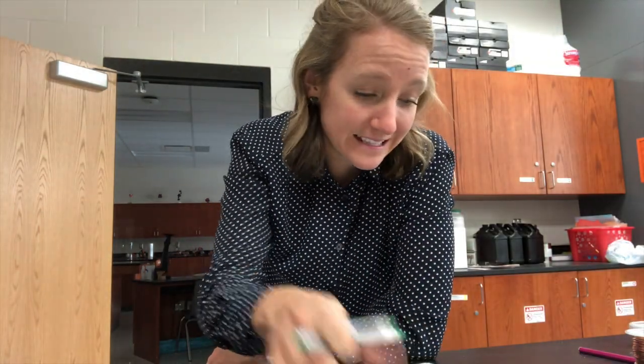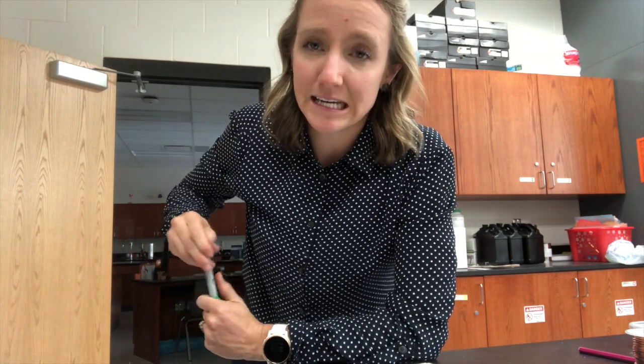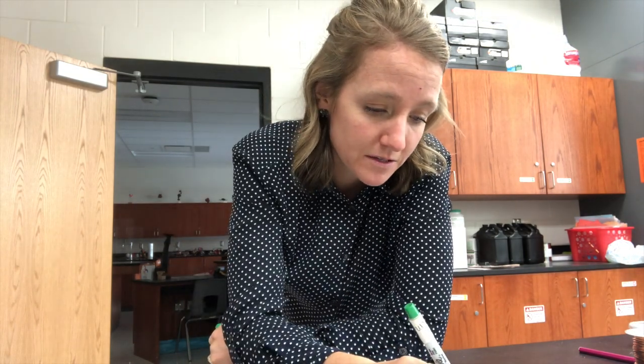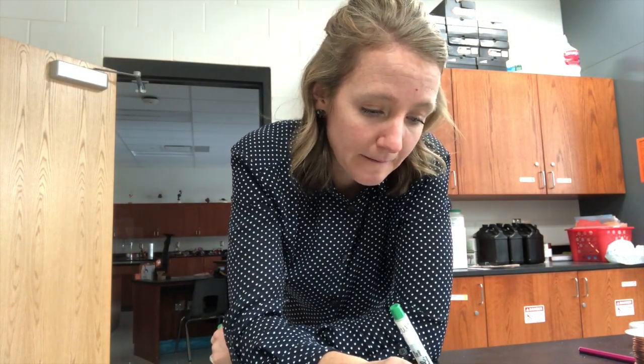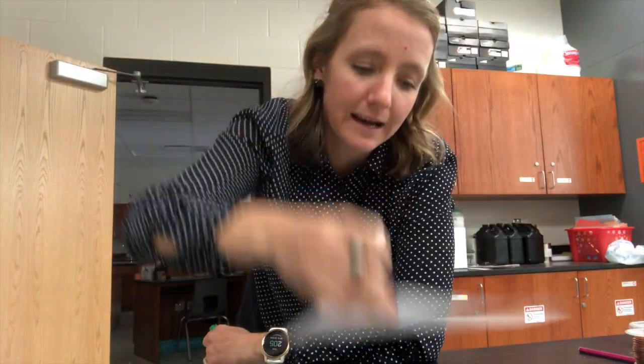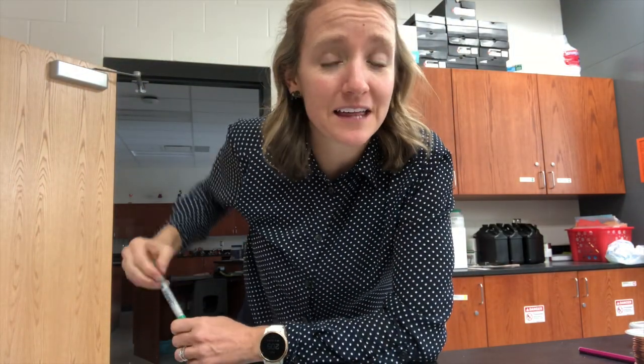So our copper wire has a mass of 3.74. And then the silver nitrate that we're using, I have made 100 milliliters of a 0.5 molar solution. So we have 100 mL of 0.5 molarity solution. I'm just going to put it together, and then I'll put my phone on it and we'll watch it go.